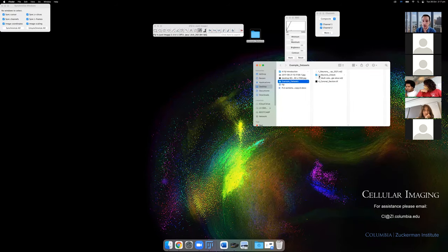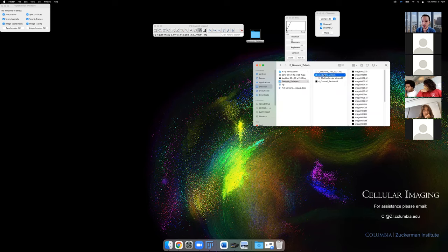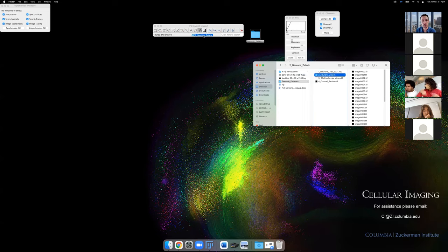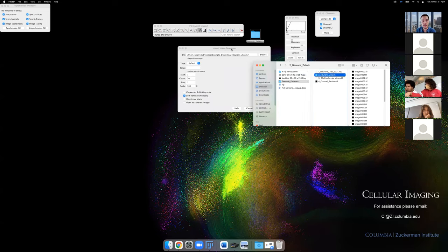For image sequences, the easiest thing is to grab the folder and drag it onto Fiji — you'll want to organize them numerically so they open in order. You can also use a virtual stack here — if it's 20 gigabytes you can turn this on and instantly start exploring the dataset without worrying about whether you're on a laptop.